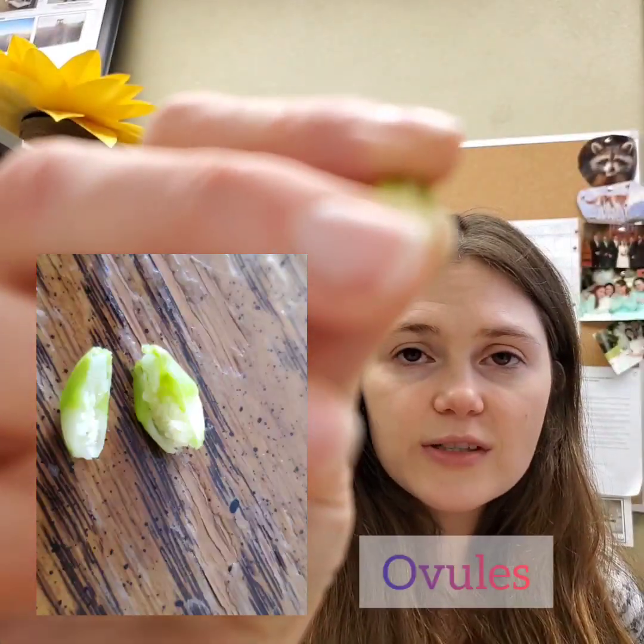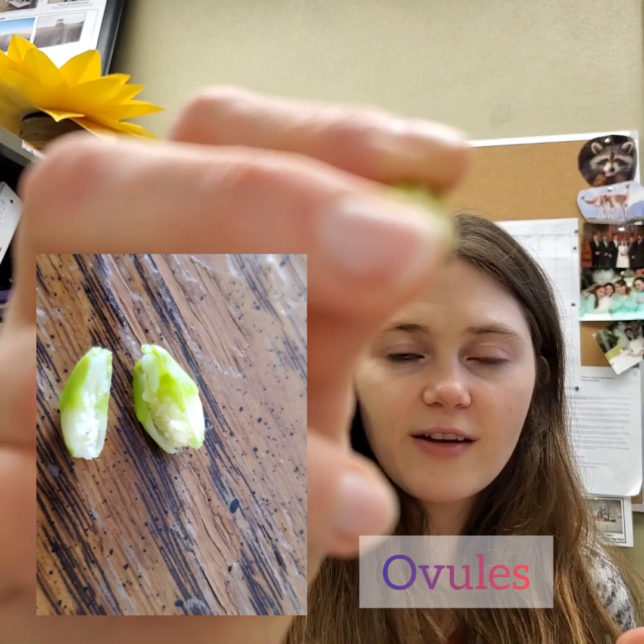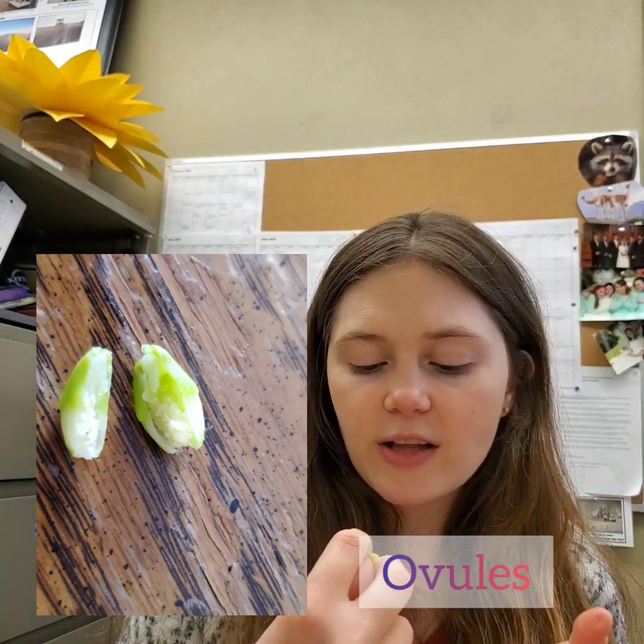So inside of here, you can see the ovules that have not been fertilized. They're all hanging out there in a cluster.